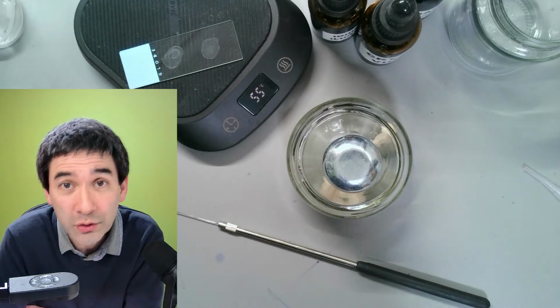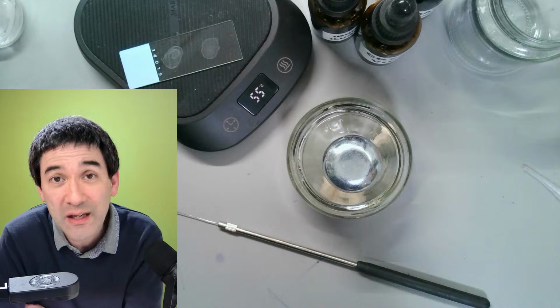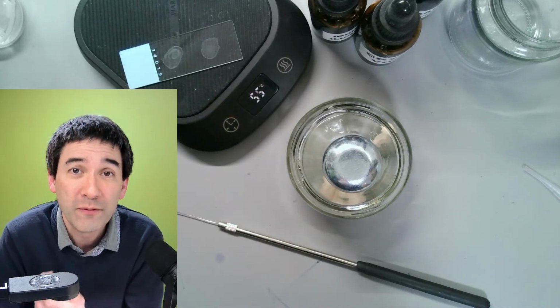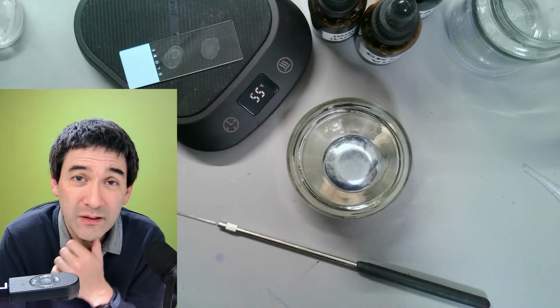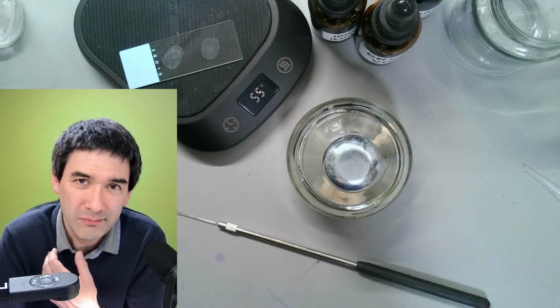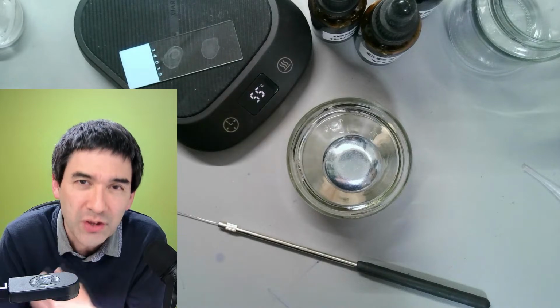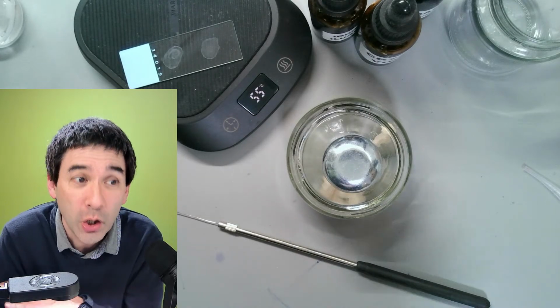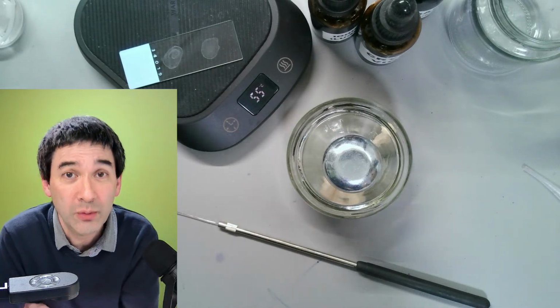Bacteria that were older did not always stain the same way as fresh bacteria. So there was even a change there. So we found out that with gram staining, you don't just stain it, but there are lots of parameters that you have to standardize, also the time of washing and the staining time and everything. All of these things I'm not going to do now, okay?